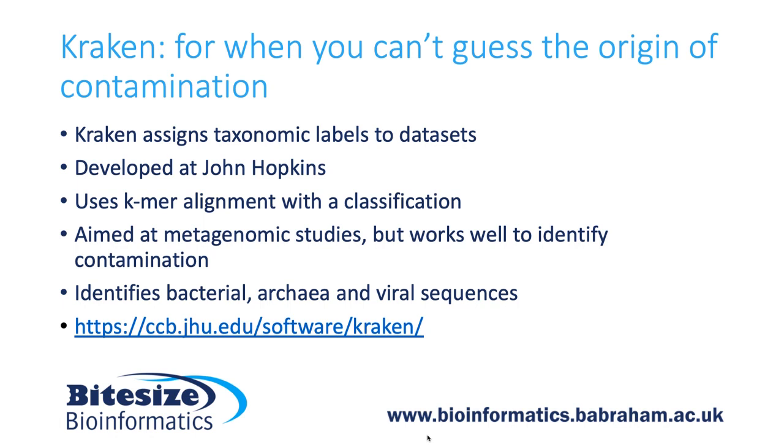Kraken uses a pre-built, exhaustive large database, including a vast array of different species, and then uses an algorithm to assign the reads to each of these different species. If reads cannot be assigned to a specific species, Kraken will try to assign them to the phylum or the genus or the order as appropriate.